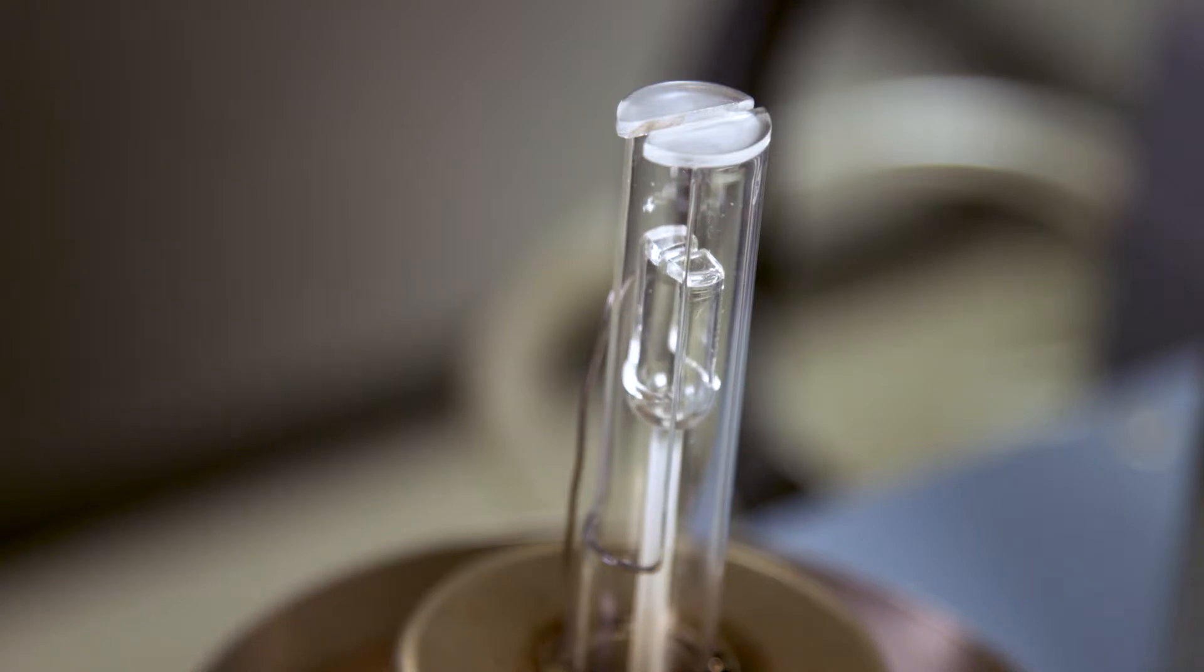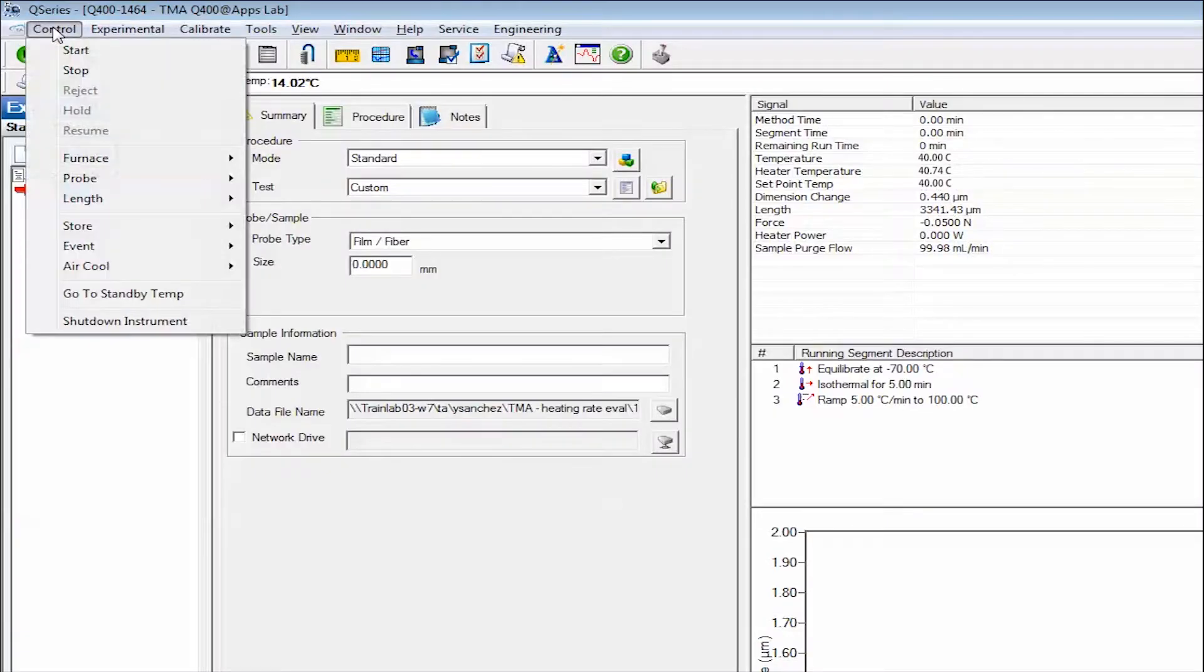Make sure the prop is in the zero position. If not, zero the prop by selecting Control, Length, Zero on the instrument control software.